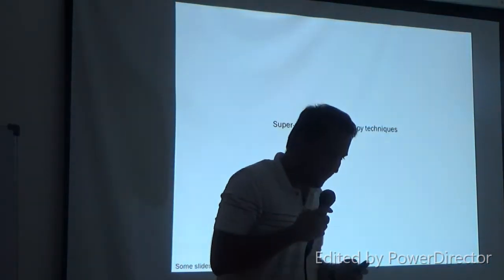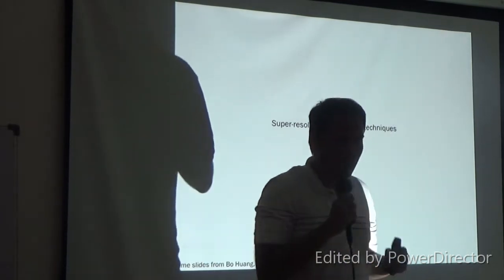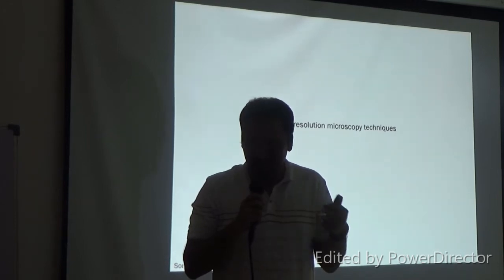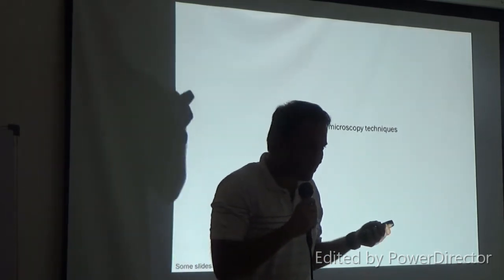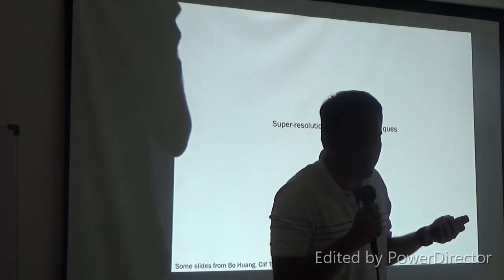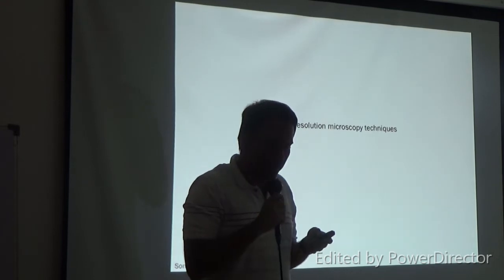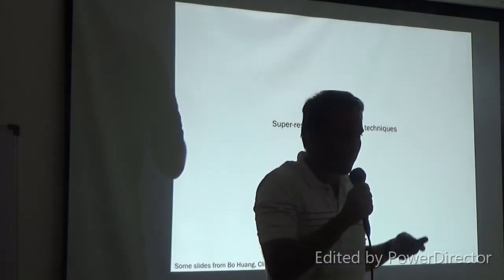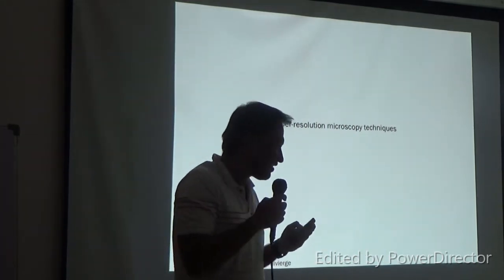So now, in the final 15 minutes or so, we talk about this. We said we have solved one problem where we can look at proteins doing their thing in living cells. Another problem we said was that resolution is only about 200 nanometers. Individual proteins are nanometers in size, right? So then how do we push the resolution of light microscopy to be in the order of, if not electron microscopy, but getting close to that?